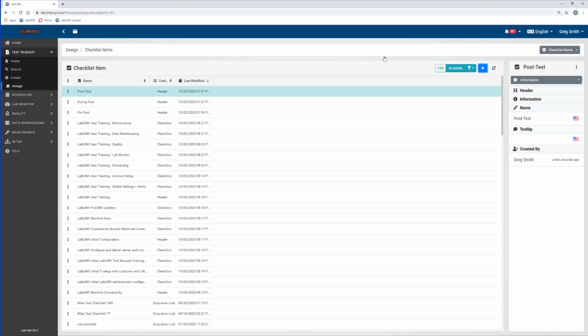Okay, so then I want to create some checklist items that I will put under each of those three different headers that we've created.